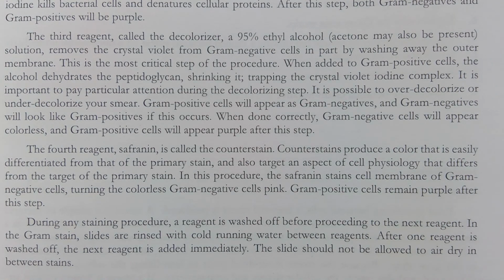During any staining procedure, a reagent is washed off before proceeding to the next reagent. In the gram stain, slides are rinsed with cold running water between reagents. After one reagent is washed off, the next reagent is added immediately. The slides should not be allowed to air dry in between stains.